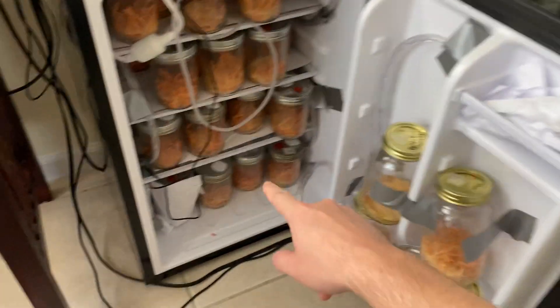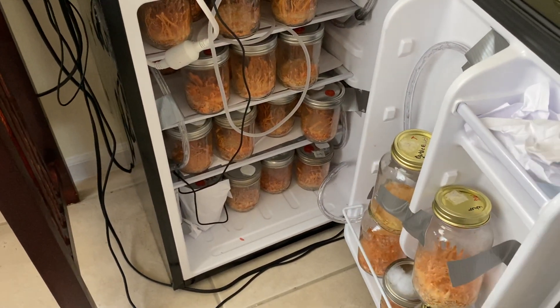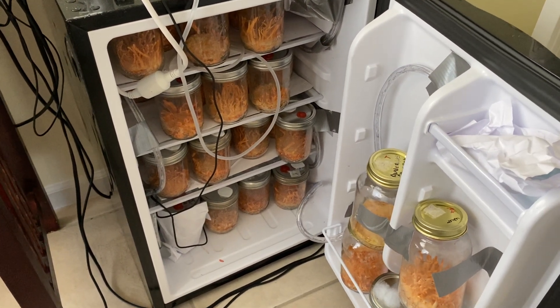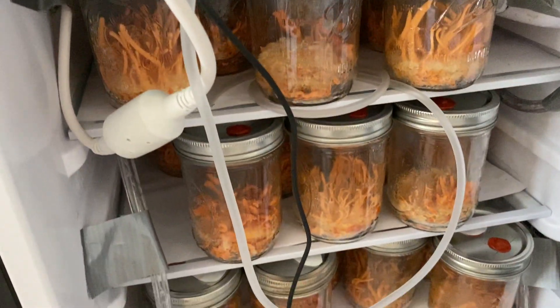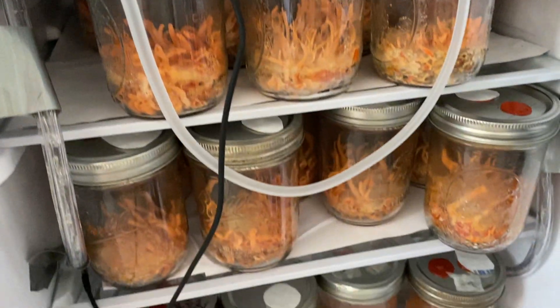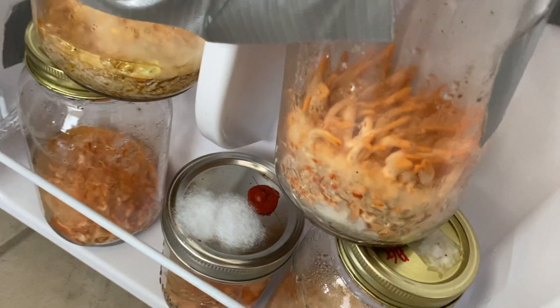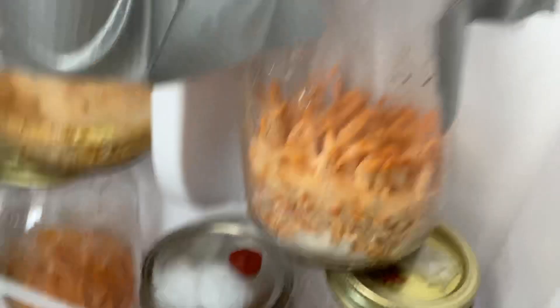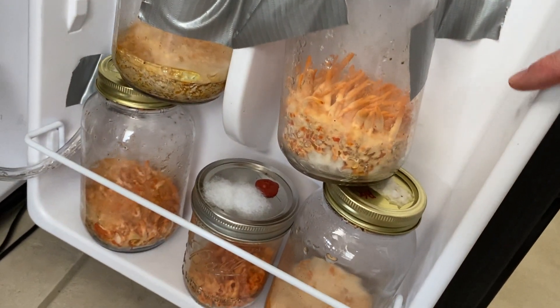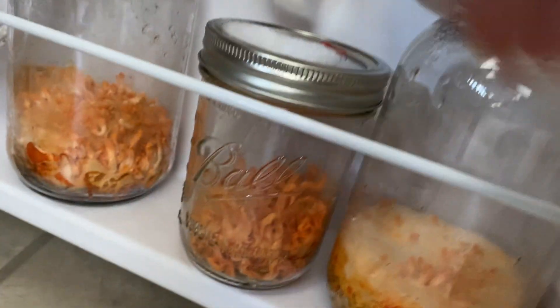I have some other stuff going on here. Down there are some pink oyster cultures that I can't keep refrigerated normally. And check out these cordyceps — there are a couple of jars I've brought to the front that aren't doing as well, but for the most part these guys are all fruiting really well. They seem happy. This is another experiment where I colonized these between 72 and 80 degrees, then threw them in the refrigerator — I don't see any green mold or anything. They look healthy, just a little slower.